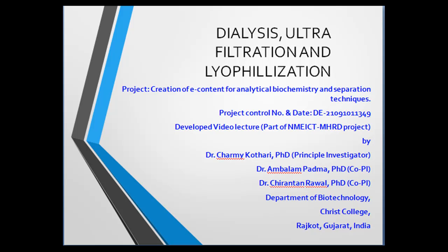Hello students, let us learn the separation techniques like dialysis, ultrafiltration and lyophilization in a simple way. To start with, we'll just go through the dialysis.